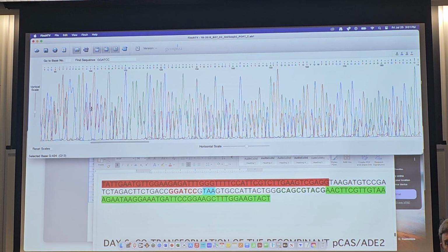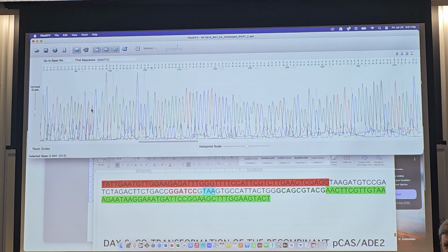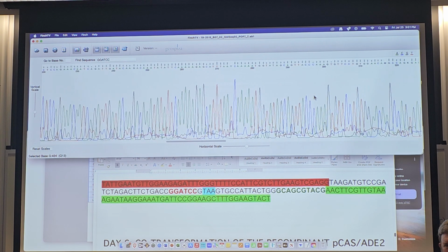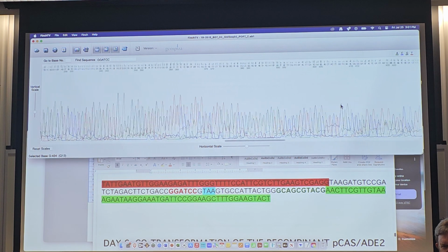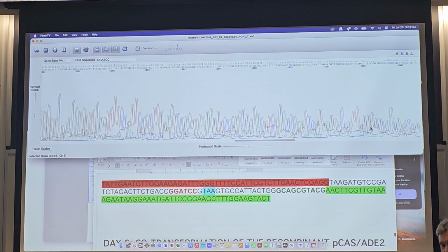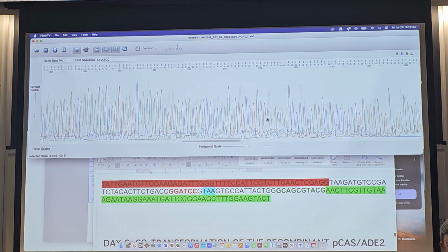So it's really problematic at the beginning of the sequence, but as we go further in, it becomes less and less of a problem. Now our sequence is actually pretty good out here. And then further on, as the peaks get lower, because we're getting further out in the sequence, this underlying sequence again starts to be problematic. So it's possible. I don't know. Now it's a weird problem that we've not experienced often.